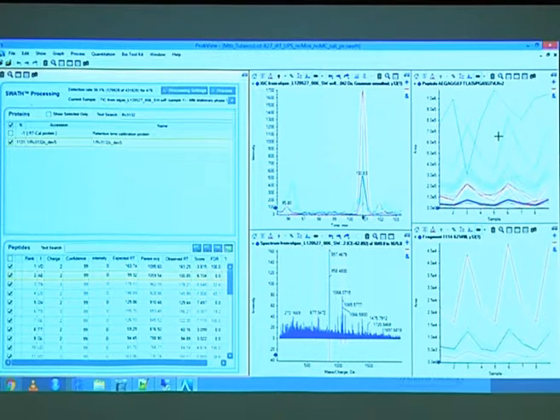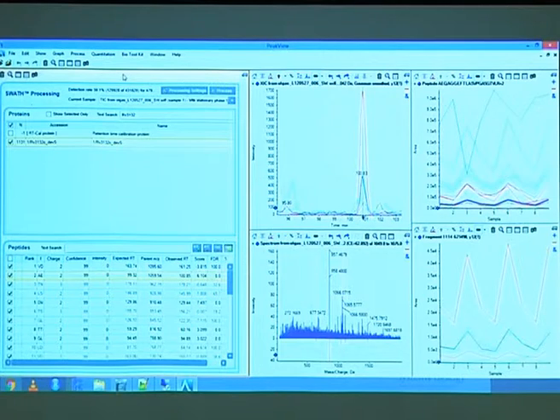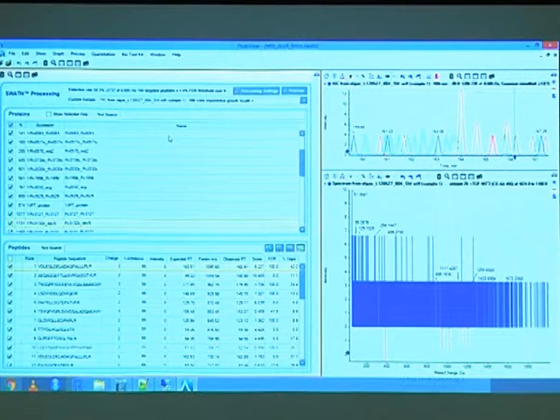This is the way it looks, and you see here most of the peptides agree with each other. Something's wrong with that blue one. But for now, we don't address that. There you would have to look into that case and see why it's not that great. But in general, these peptides look good. What I do now is I close that session and I open a session where I only use these 34 proteins that we had before. And this is the same protein.